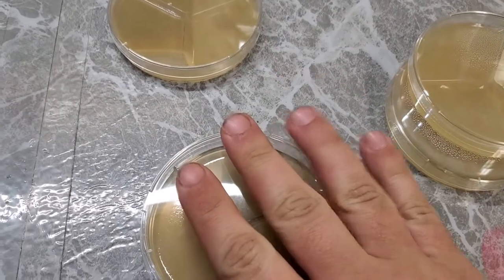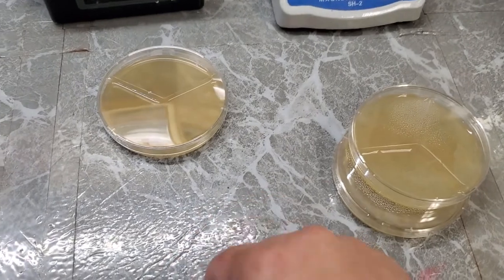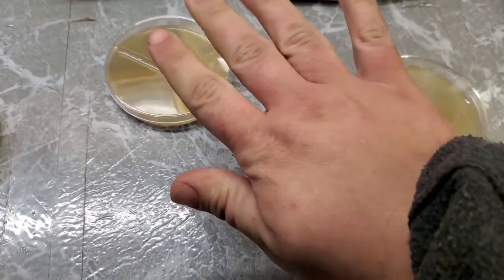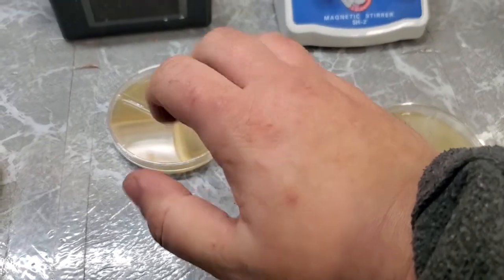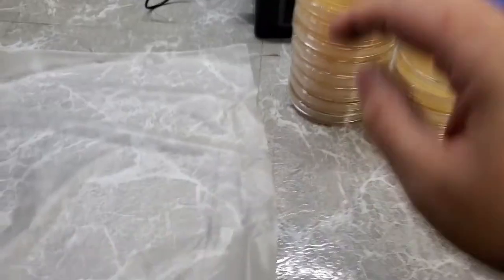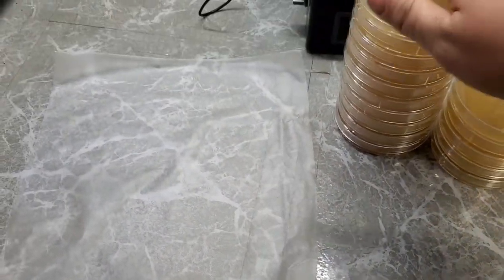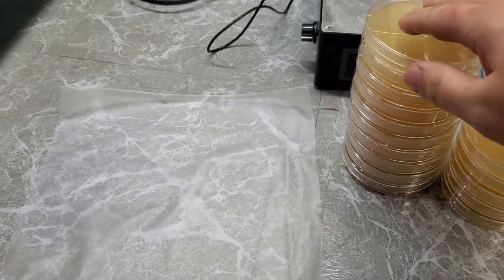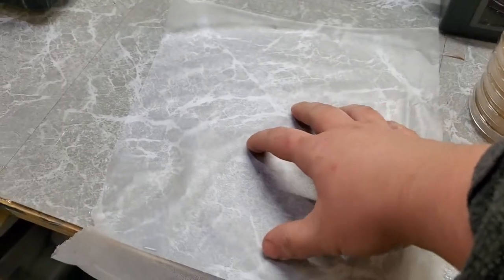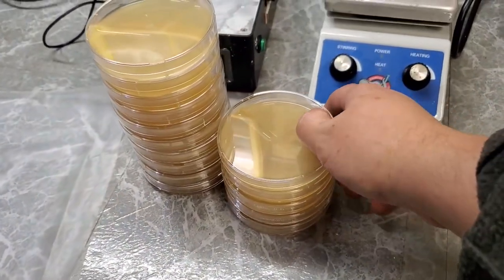Hopefully that video was a little bit easier to watch than my other video for some people. Mushroom season — I can't wait. One last thing I forgot to mention before I conclude: if you are not going to use these within a week, I highly recommend wrapping them in press-and-seal wrap, cling film, aluminum foil, or even just putting them in a big bag — that way they don't dry out.